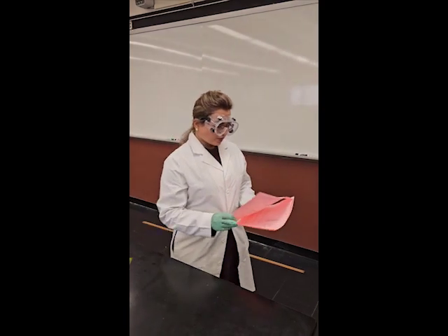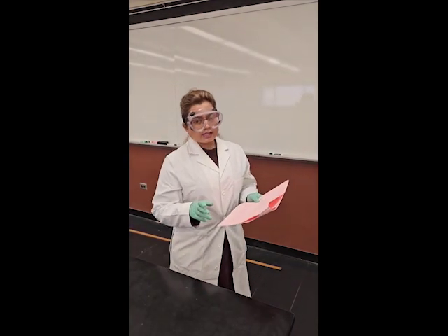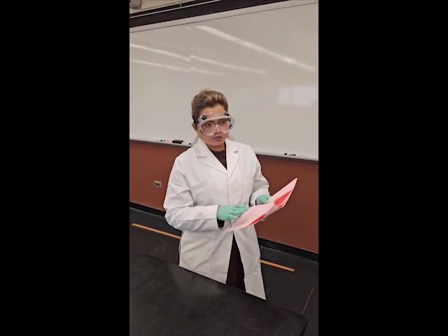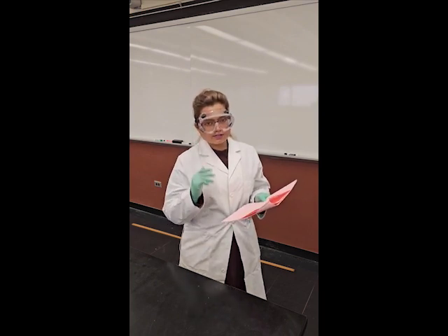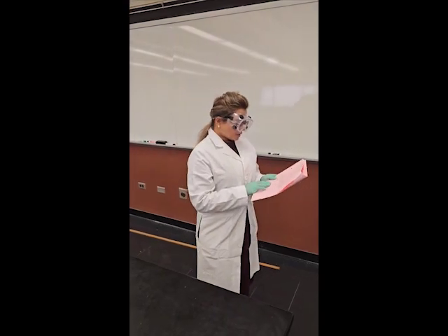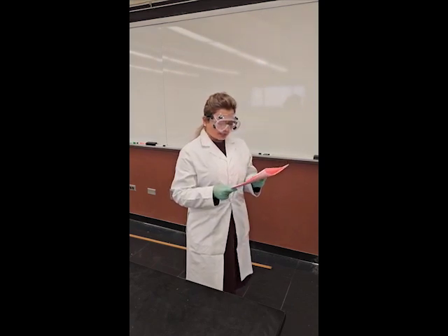Okay, so for the first experiment, before you come to the lab, make sure you read your lab manual, because we don't want anyone to get lost when they do the lab. So at least you have some knowledge before you come to the lab. First procedure, it says to measure and record your height using a meter stick.